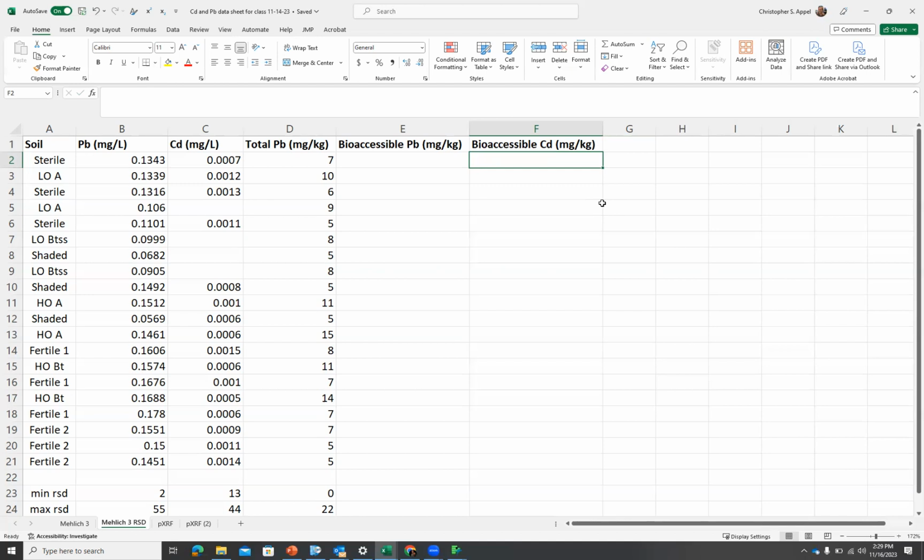Okay, so that becomes 10. So all we have to do is multiply our quantities in solution by 10, and that'll take it over to parts per million on a mass basis. Any questions? Seeing none. Shannon.